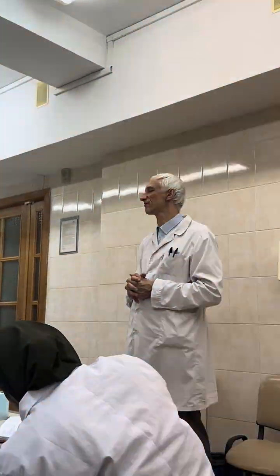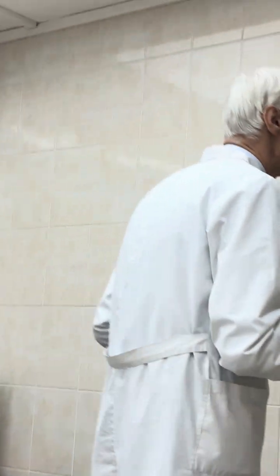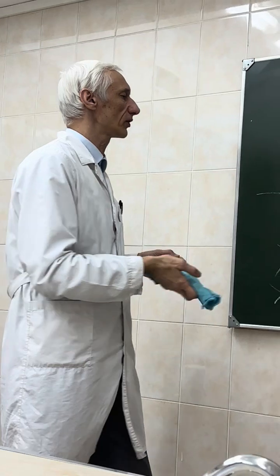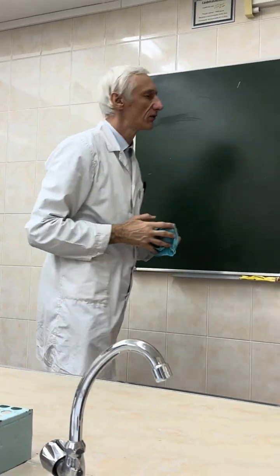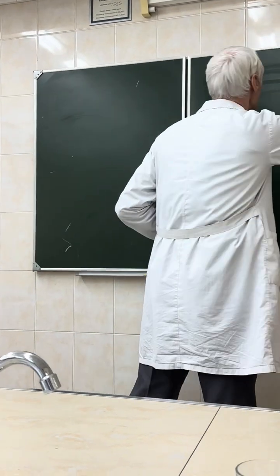First of all, please, which kind of microscopy do we use? Bright field. Which version of bright field? Immersion oil technique. So that's why revise all the introduction, and if you remember, all microscopical test methods are joined together in our book. So revise the beginning. The beginning also includes resolving power, and this resolving power explains why we use the immersion oil technique.